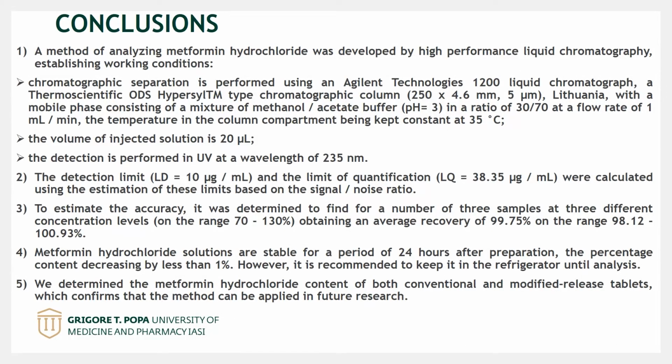1. A method of analyzing metformin hydrochloride was developed by high-performance liquid chromatography, establishing working conditions.